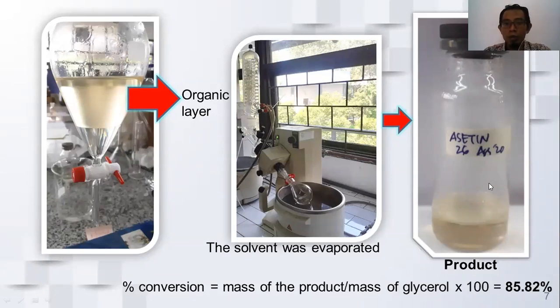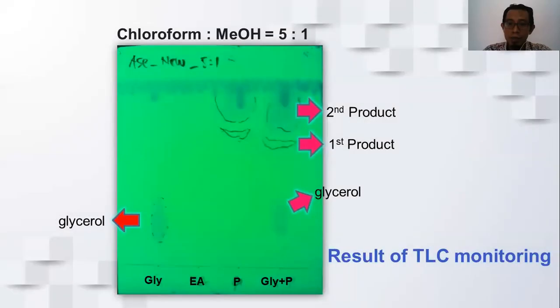And then the mixture was analyzed by thin layer chromatography. Here, there are some spots.